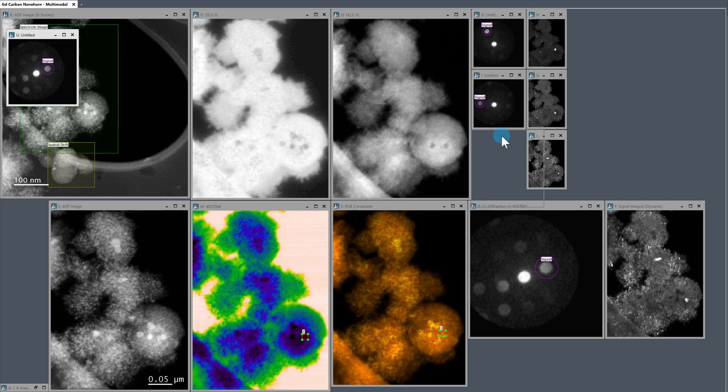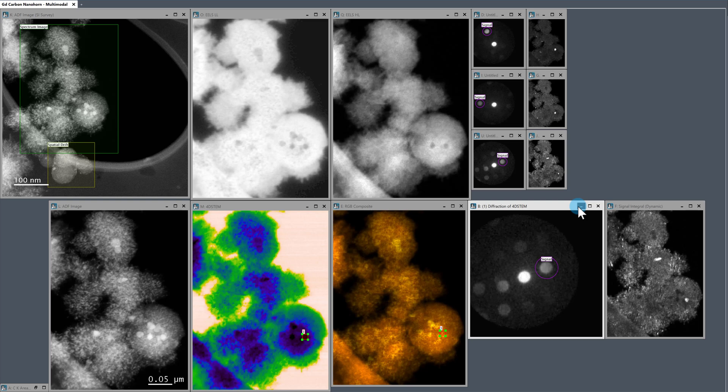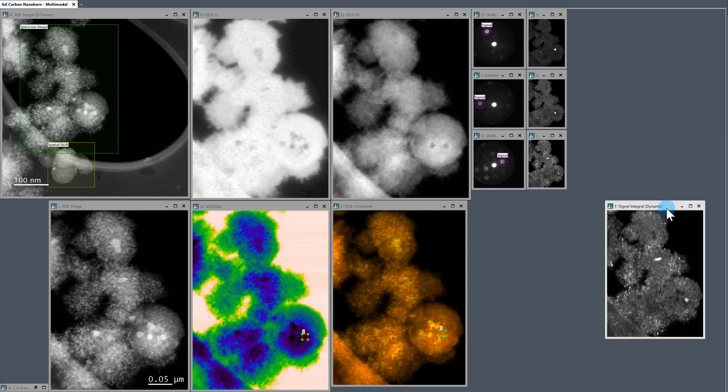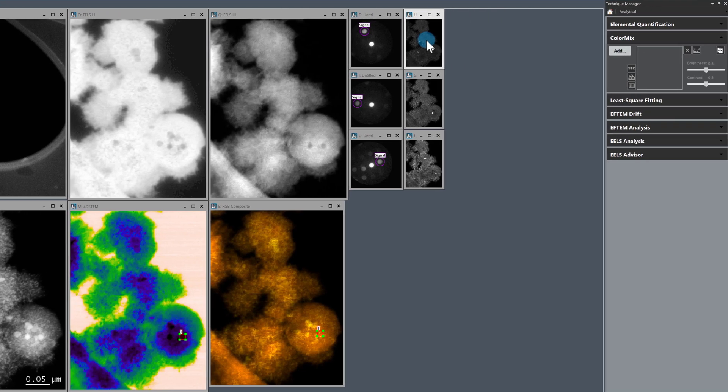Okay. So that's all I wanted to do with that. So now I can minimize the live extracted pattern and the live map, because I don't really need those anymore. But what I want to do is I want to do an RGB composite of these three maps, which I'm going to do now.